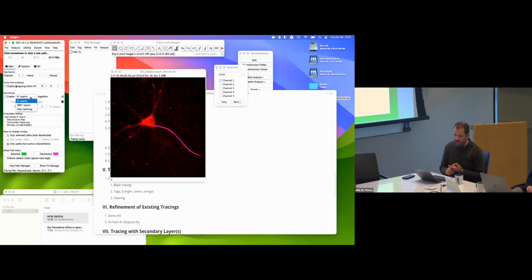The core of the search is the A star that Mark still had in the original Simple Tracer. We just did some minor modifications. And then we wrote one that was published more recently, which is called NBA, which stands for New Bidirectional A star. Depending on the images, it can be faster, but I have to say the results are very similar.